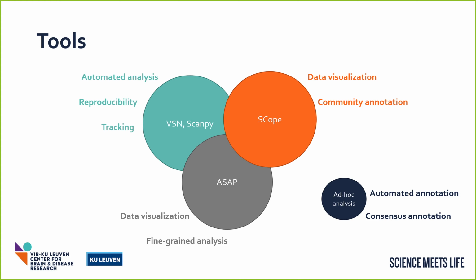And then ASAP, which is developed by the lab of Bart de Plancker, is for more data visualization, but also fine-grained analysis. So it's another portal into the data. Alongside this, there's also ad hoc analysis to be done, for example, automated annotation and consensus annotation. That's not going to be touched on here.